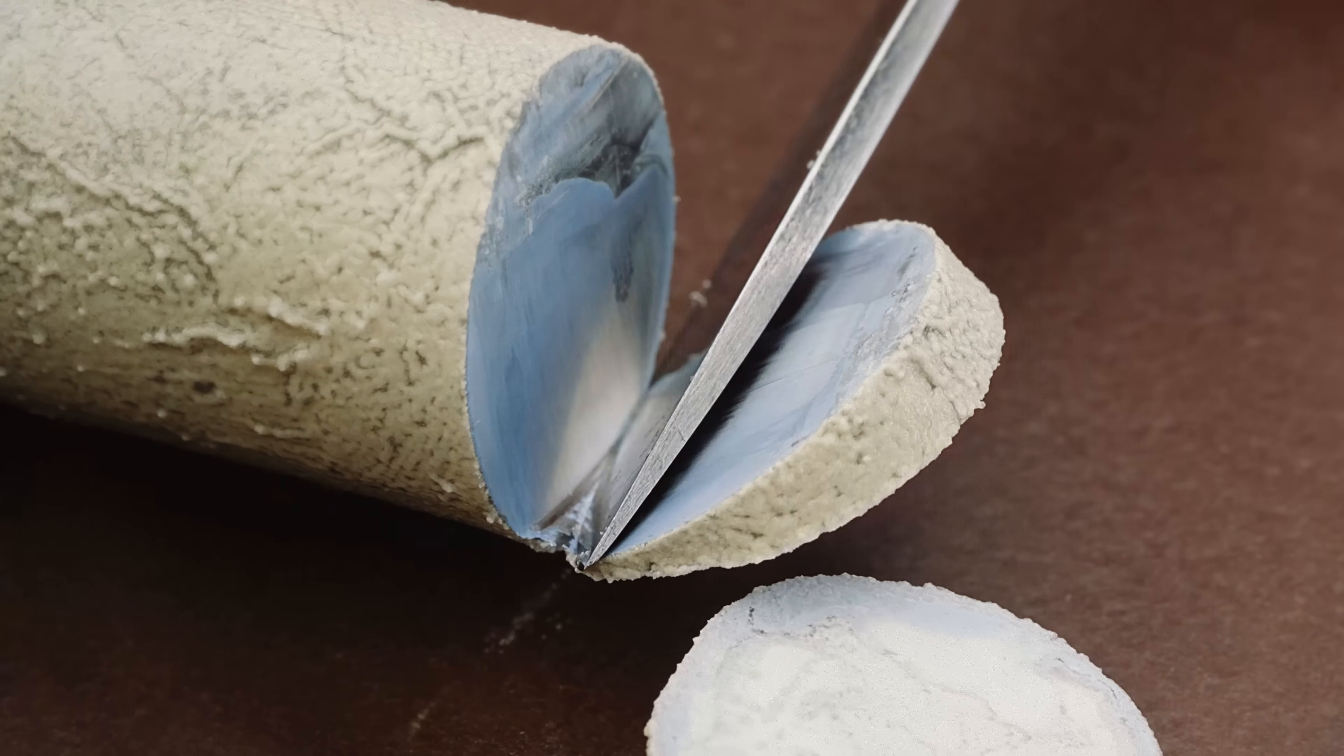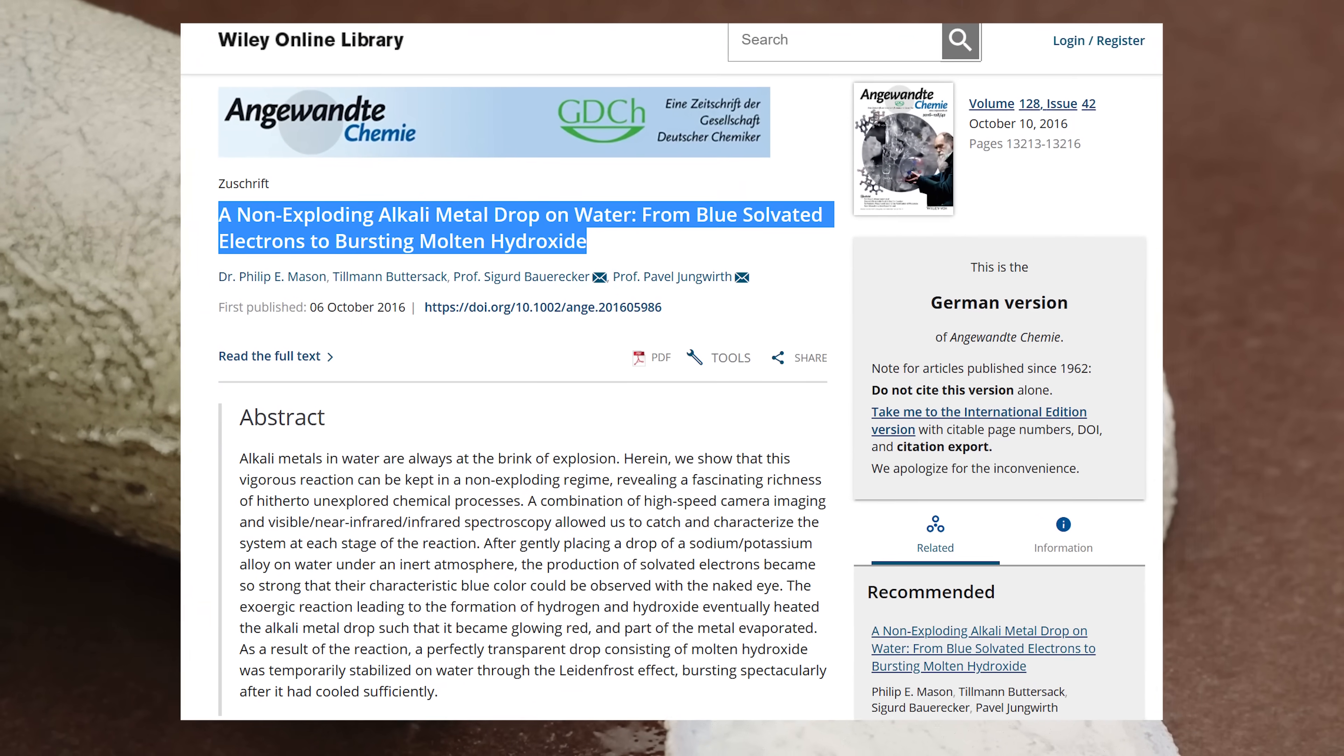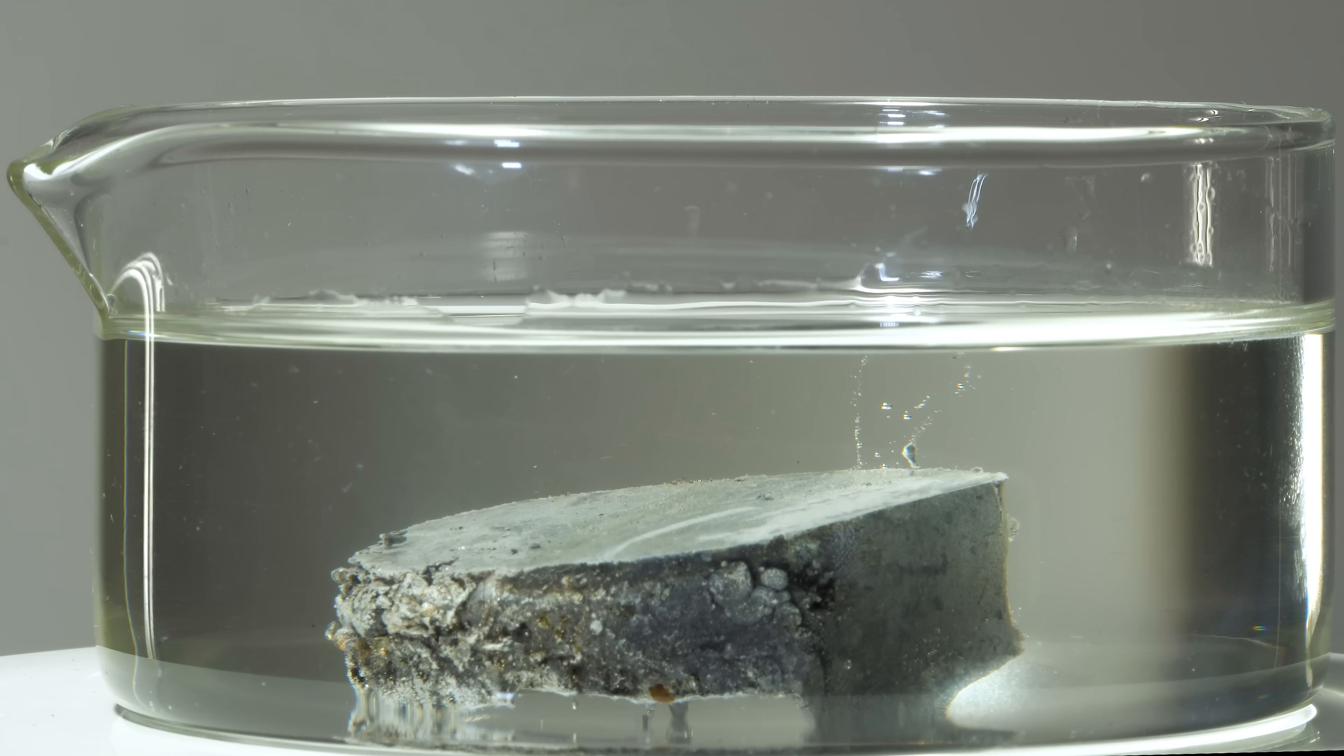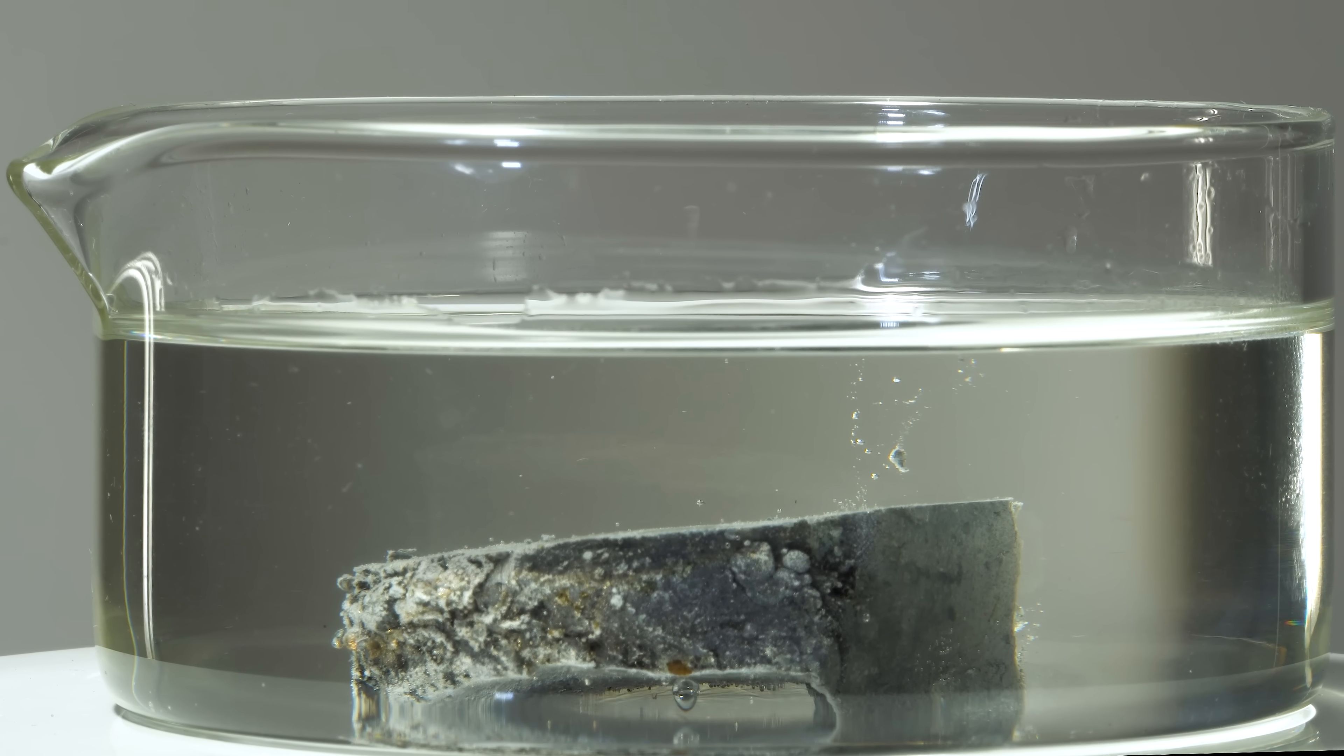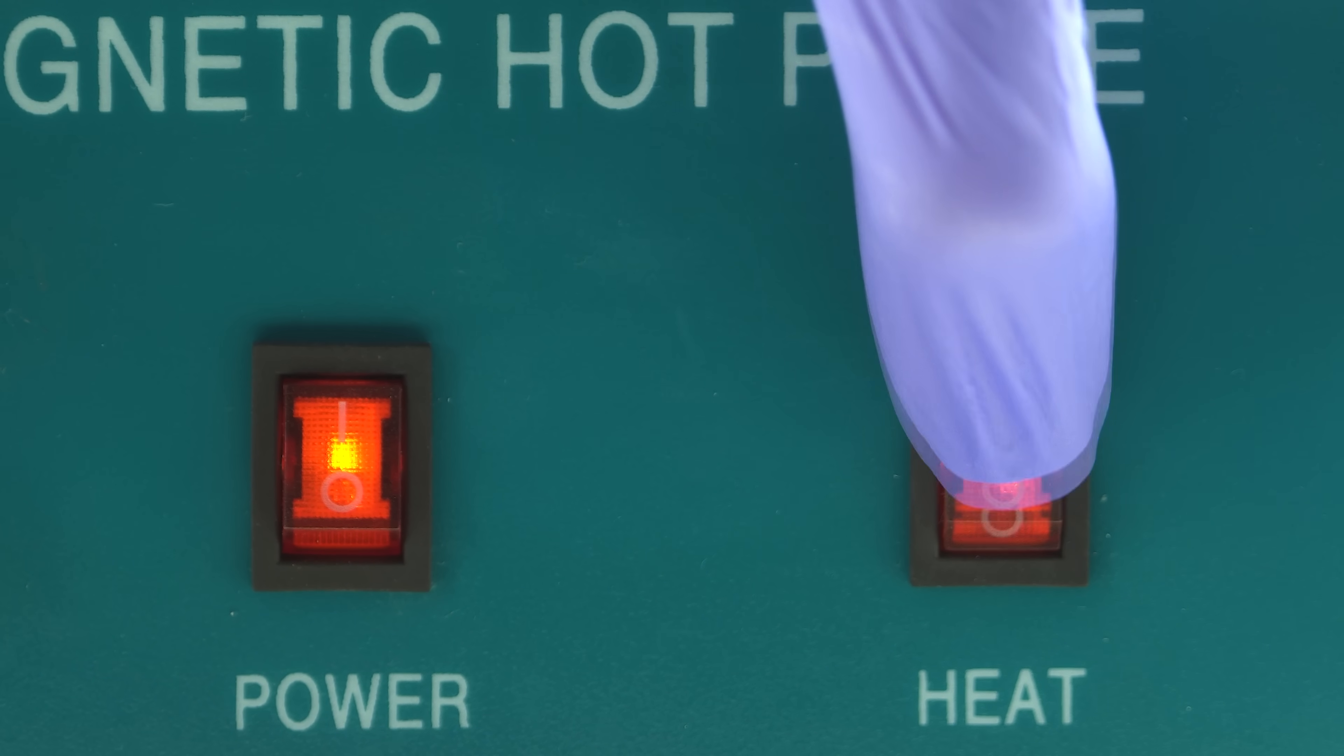In short, we can observe the blue color of solvated electrons not only when alkali metals are dissolved in liquid ammonia, but also in water. Now I'm going to create a sodium-potassium alloy by mixing pieces of sodium and potassium in hot oil to showcase this effect.